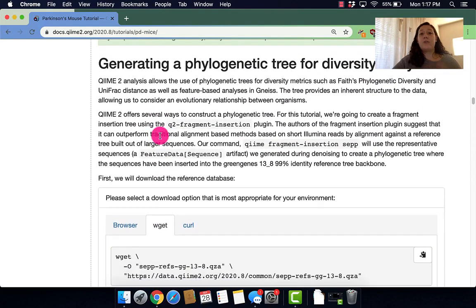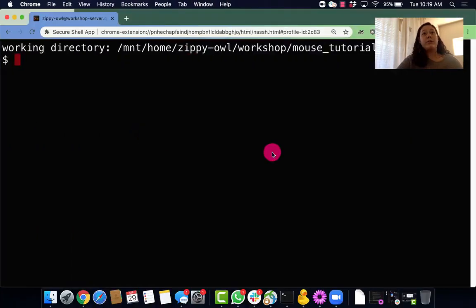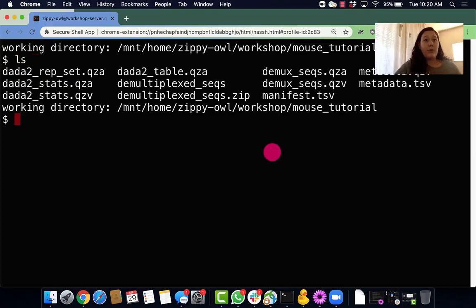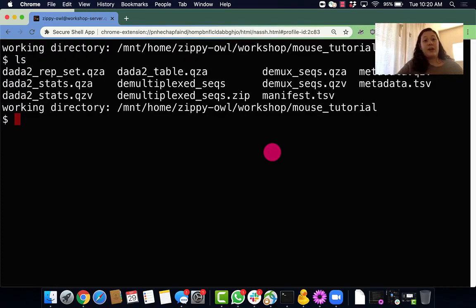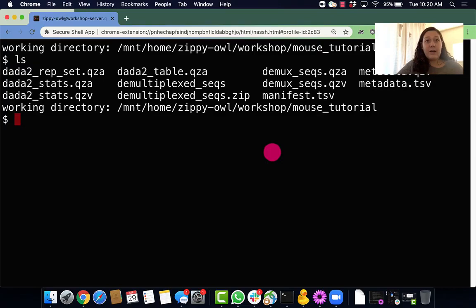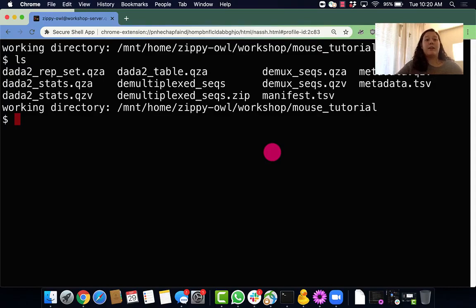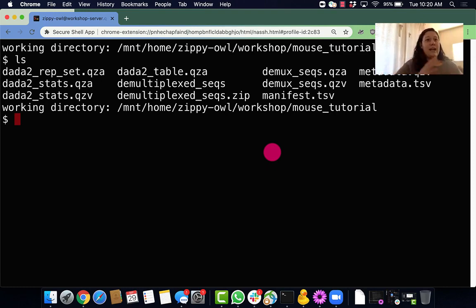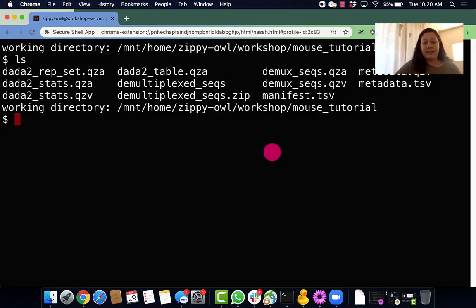Before we get into creating a phylogenetic tree, we're going to recap where our last tutorial left off. In our last tutorial we denoised our data, so you'll see a bunch of dada2_set or dada2_anything data which all came from our denoising step. So now that we have good quality data, we'll be able to make a phylogenetic tree. For our phylogenetic tree we'll be using the dada2_rep_set.qza, and once we have our phylogenetic tree we will have completed the last step before we actually get to the heart of the analysis.